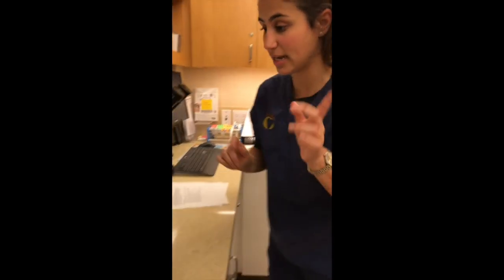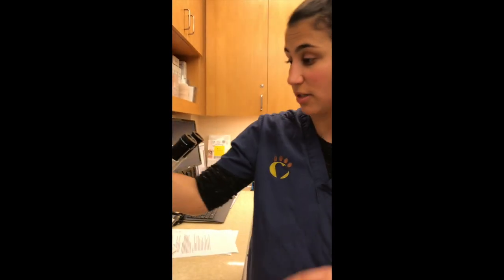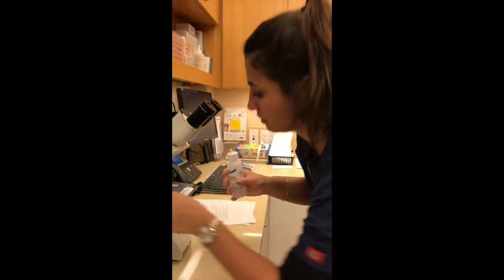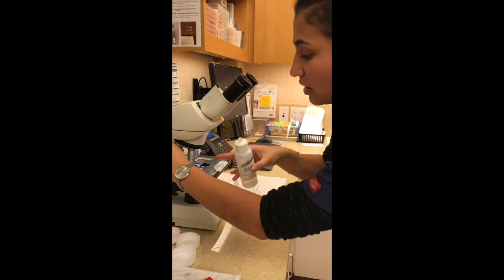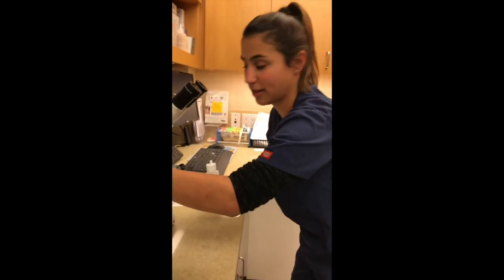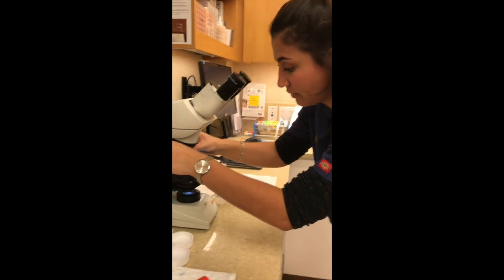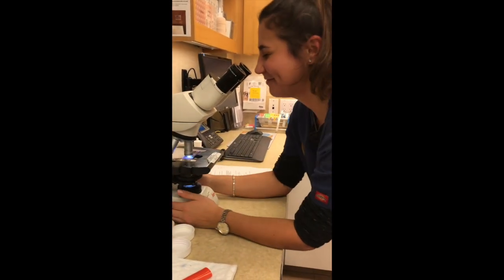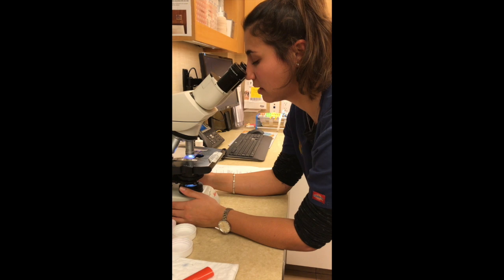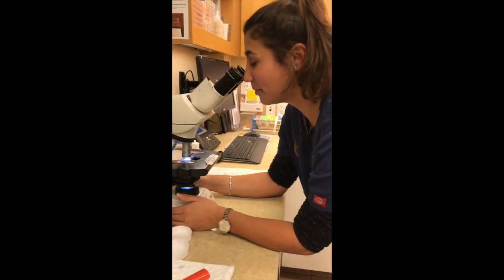Great. And now the next step, the next level we have, we actually need immersion oil to put on the slide before we move this. So I'm just going to move it in between and put a drop of the immersion oil on. Now this is our 100 times view, our highest plane. Just like that. Now I'm just going to adjust. I'm going to brighten it a little bit as well.